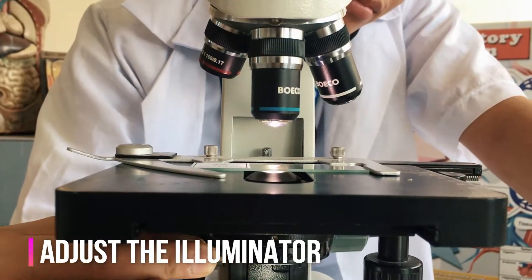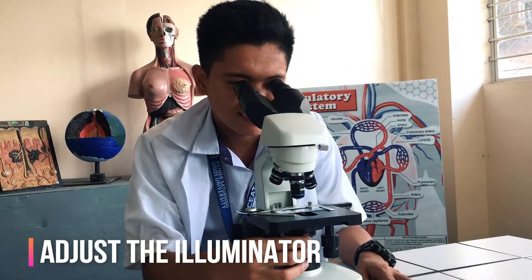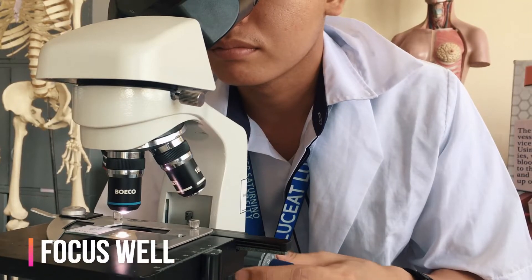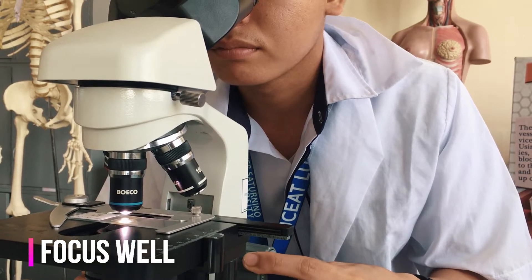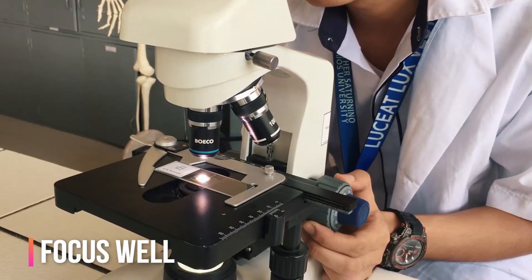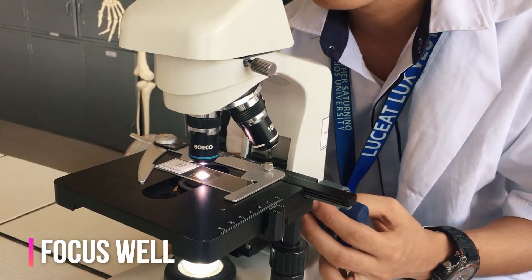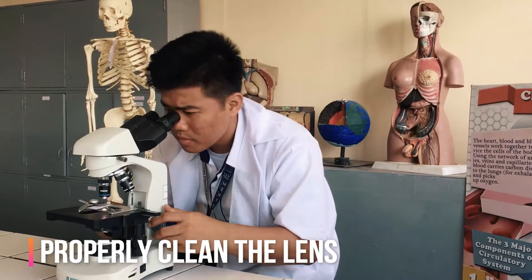Now look through the eyepiece and adjust the illuminator and diaphragm for the greatest amount of light. Slowly turn the coarse adjustment knob so that the objective lens goes up. Continue until the image comes into focus. Use the fine adjustment if available for fine focusing.